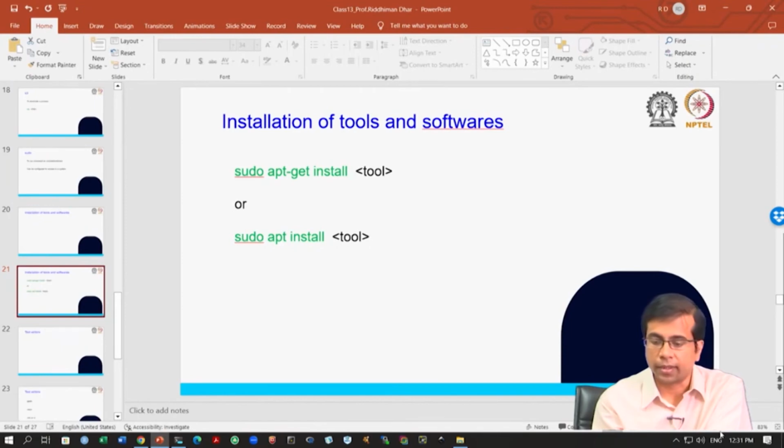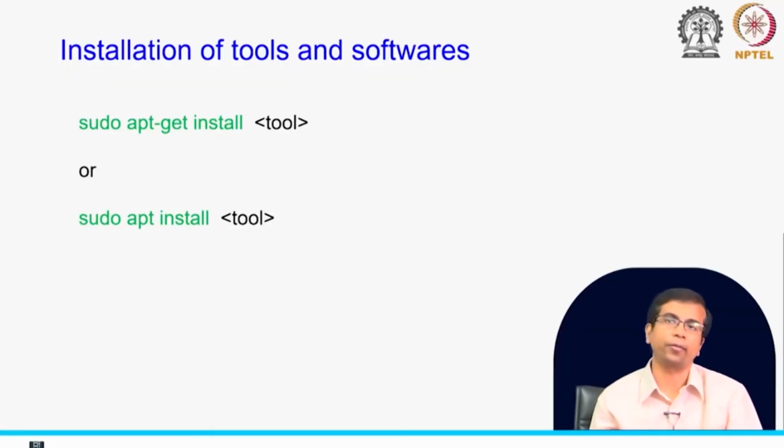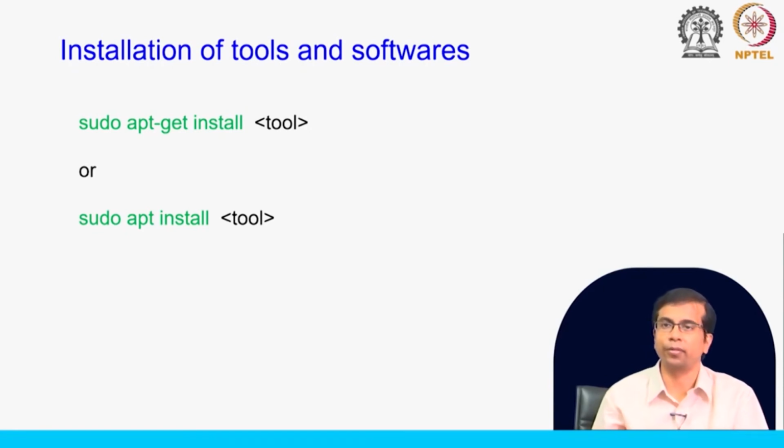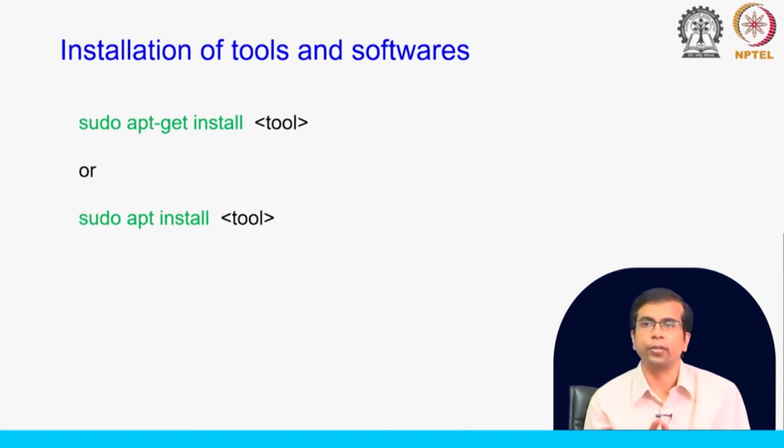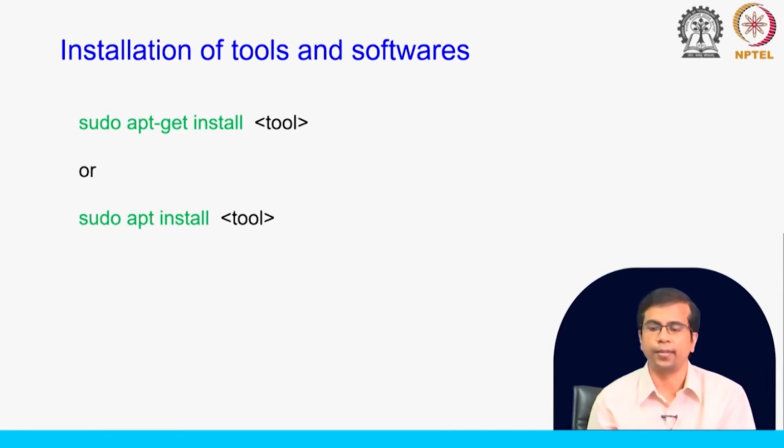These are some of the commands that are very useful in brief. There are of course many more commands, many more utilities that you can use through the command line, but those you can learn later. This will be enough for NGS data analysis. Now, we will talk about certain text editors and data exploration.